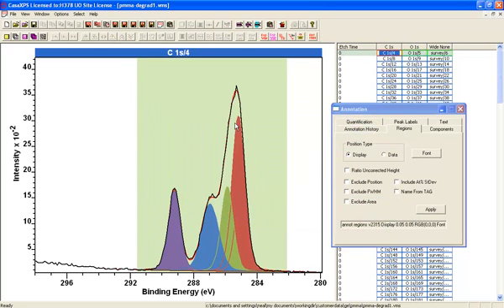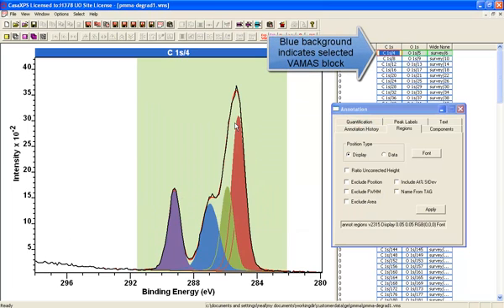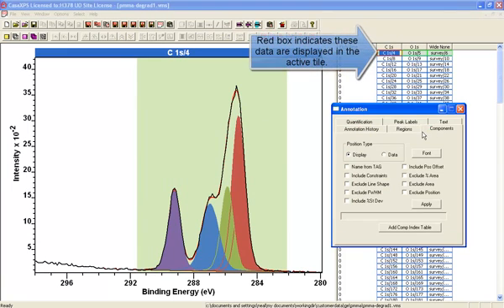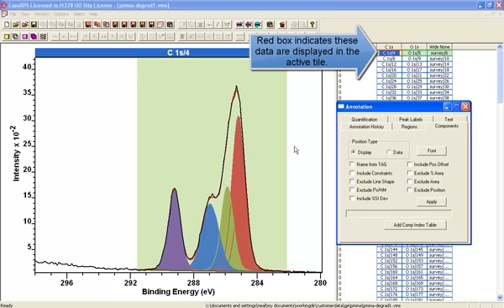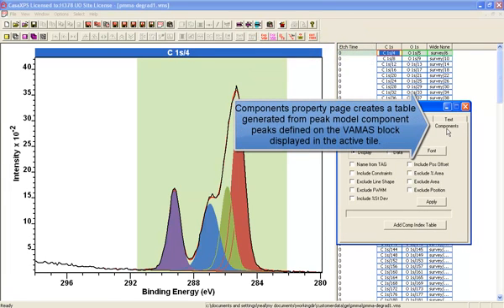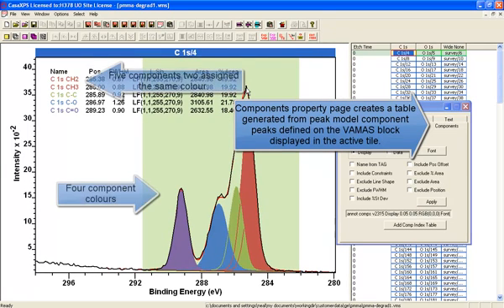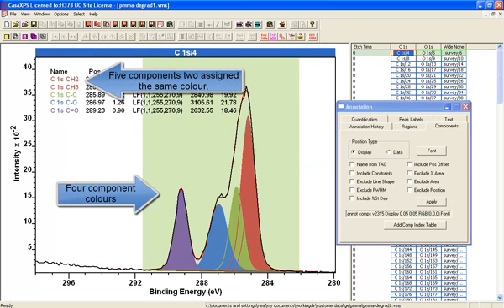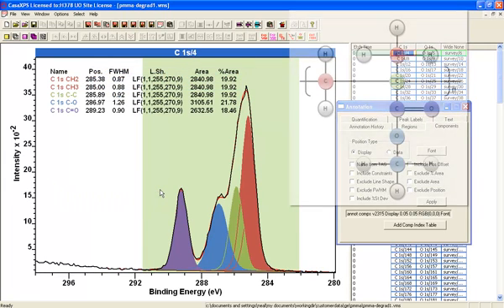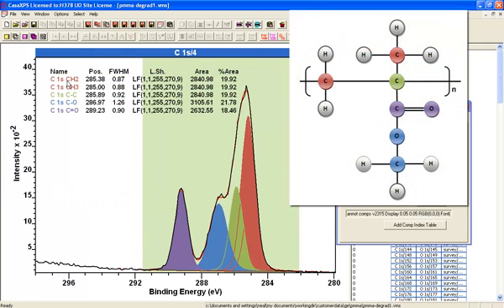In the case of a narrow scan, where we have a set of peaks and we would like to see the relationship between these peaks in terms of percent area, the components property page allows you to see a similar sort of table. Using the components property page, we gather information from the spectrum displayed in the active tile and it displays the components as a percent area.